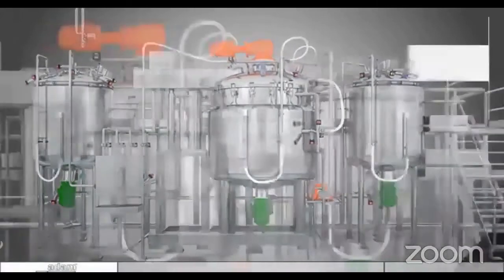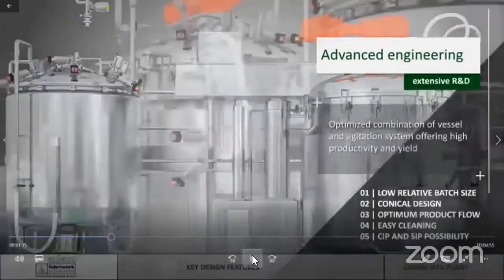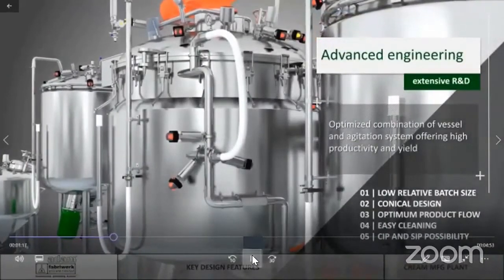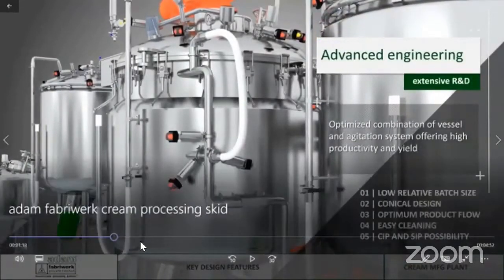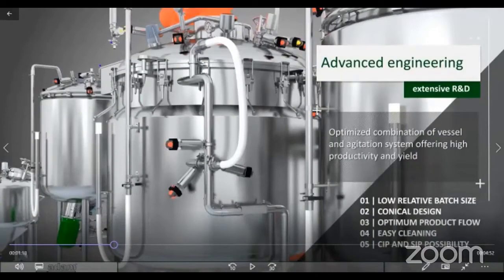CIP also is part of the system. The conical design of the bottom of the manufacturing vessel ensures lower batch sizes are possible within the manufacturing vessel. It's also ease of cleaning and ensures high degree of CIP ability and SIP ability for specific operations.